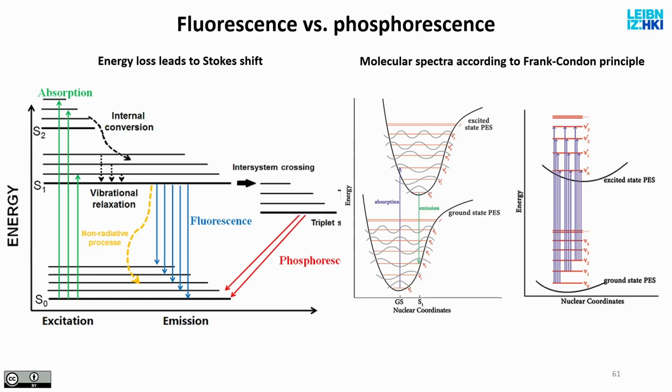And depending on the energy structure and the wavelength of the light that we use to excite this molecule, this emitted photon can also be a visible light photon. So we can see it. And if you can see it, we can detect it, we can put it in a microscope, and we can use it to label particles with these molecules.